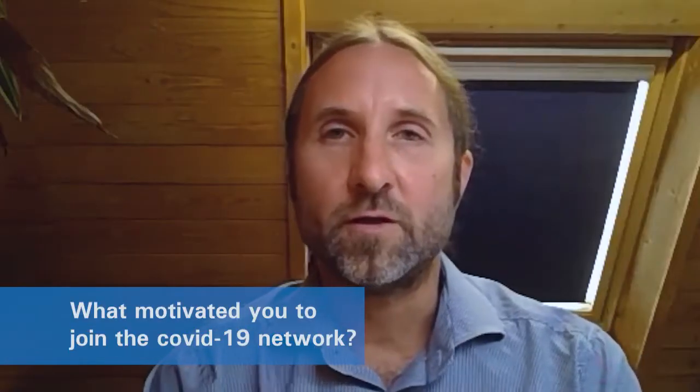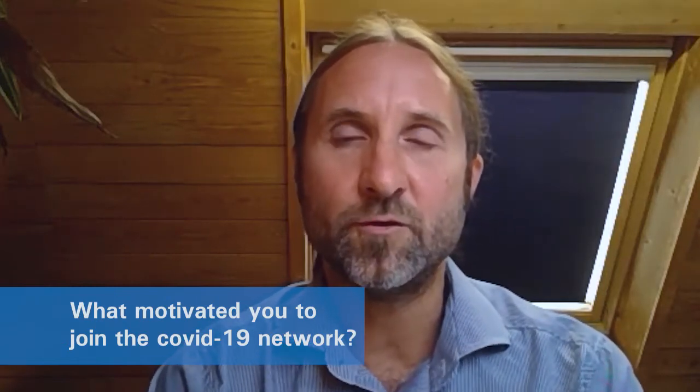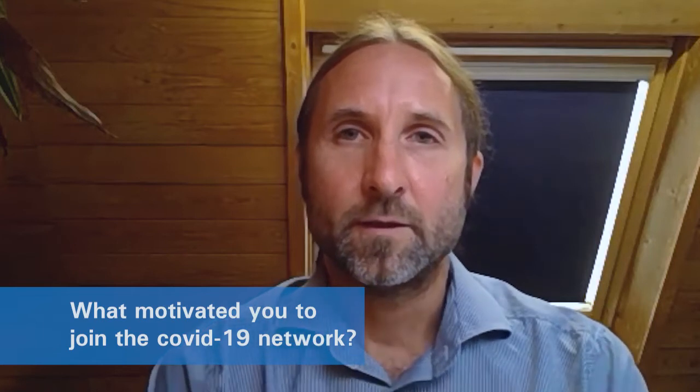Well, first of all, it was the wish to contribute something to the research about this really fatal coronavirus disease. When the pandemic started, a lot of groups also at the research campus in Tübingen started to do their projects. So we had a small project with our partners from the medical genetics where we investigated, on the genetic and inflammatory scale, immune cells from COVID patients that were separated from the blood samples.